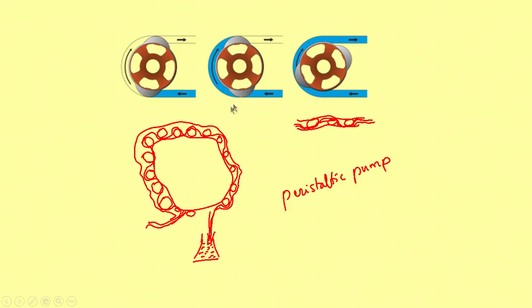I had shown you this figure, I had told you that there will be bearings around which a tube is going round and round, one below, one above, one below the bearings, and the tube carries the sample through a conical flask, and here you can see the principle of the sample introduction using a peristaltic pump.